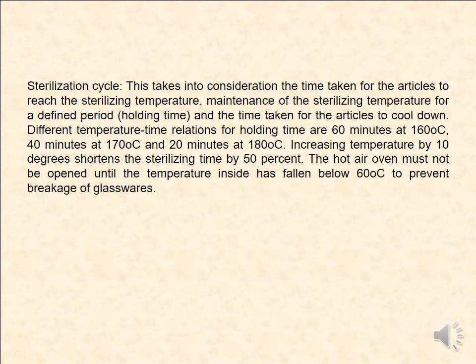The hot air oven must not be opened until the temperature inside has fallen below 60 degrees centigrade, to prevent breakage of glassware.